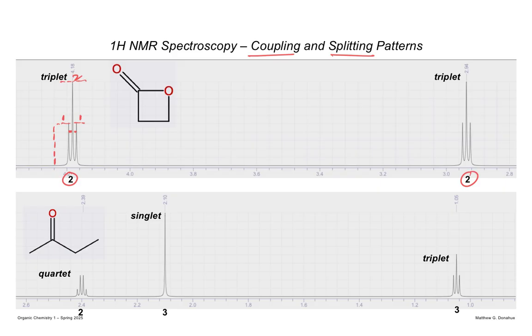So we want to understand not only the intensity of the lines, how high they are, but the distance between those lines. And again, that all comes back to why the NMR experiment exists, this nuclear spin. That's what is being detected. So we have on here a singlet, a triplet, a quartet. We'll walk through all of the fundamental ones that we need to know and understand why the neighboring spin gives rise to this multiplicity, is the word I'll use.